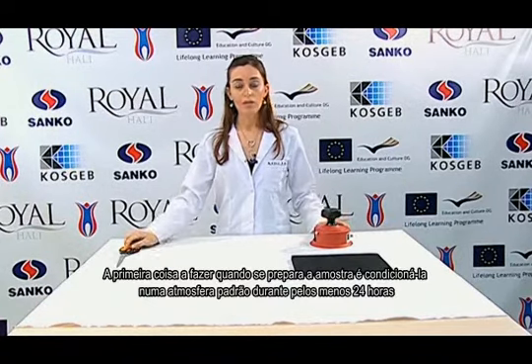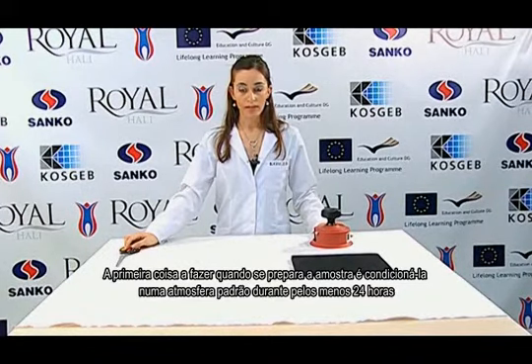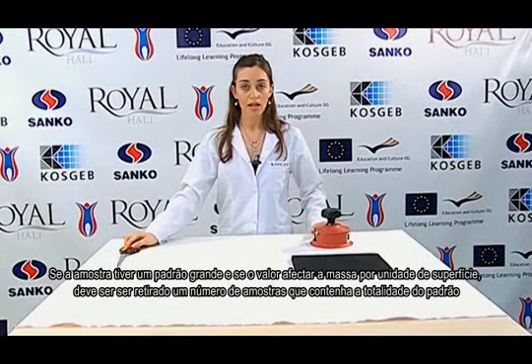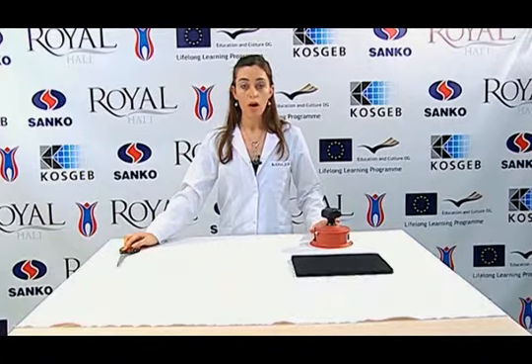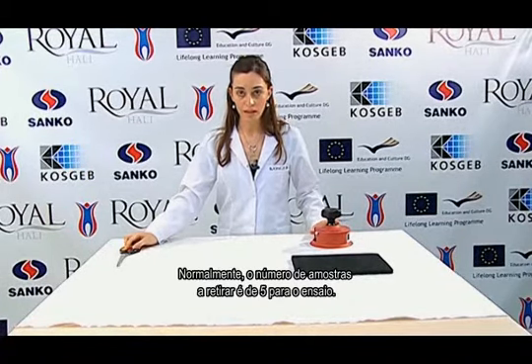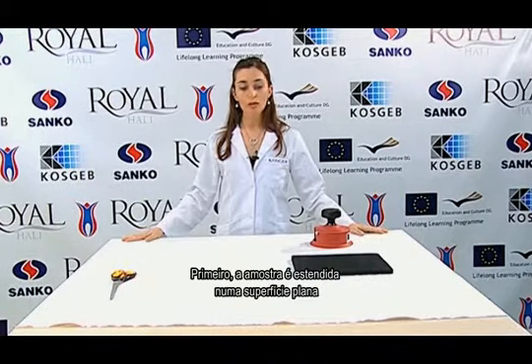The first thing to do when preparing the sample is to condition the sample under the standard atmospheric conditions for at least 24 hours. If the sample contains a wide pattern and the pattern affects the mass per unit, a number of samples to contain the whole pattern should be taken. Normally, the number of samples taken is 5 for the experiment. Primarily, the sample is laid on a flat surface.